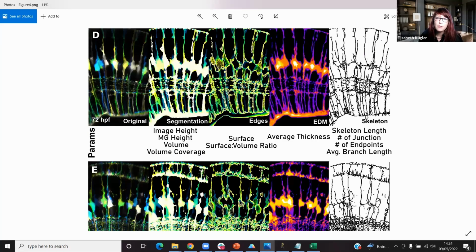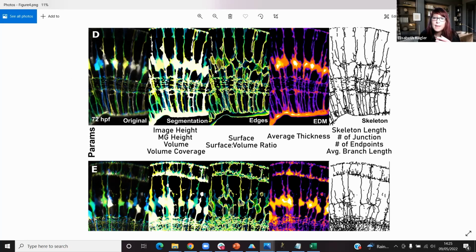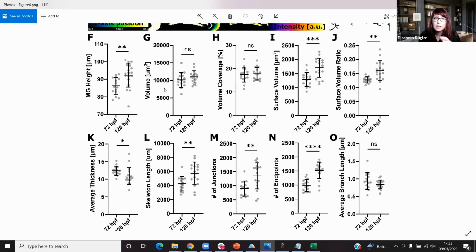And then in terms of how we visualize the data, again, it's various different ways. But I've started to actually use depth coding for my 3D stacks because I find it very intuitive to say these are 3D data. And again, it's just a question of visualization, but I think this is useful to show people that we work with 3D data, because often you could assume that you work with 2D data, but you actually don't. And then basically all that I've done down here is just plot all the data that we get out of the GliaMorph toolkit and look at them against each other. So when you run the tool, just rerun it now, you will have all of these data at this point and can look at them.